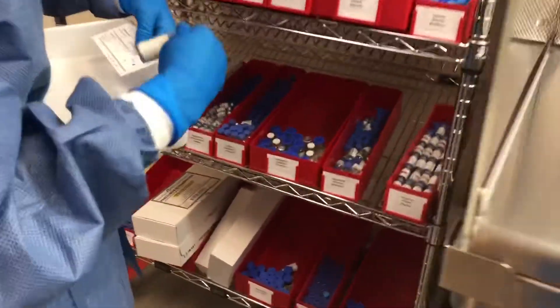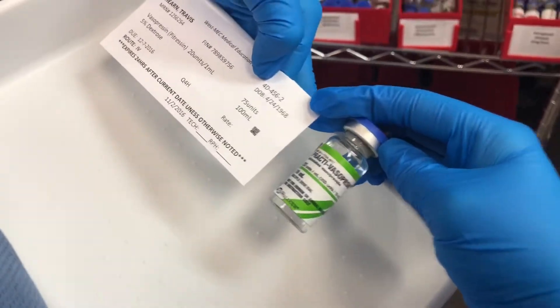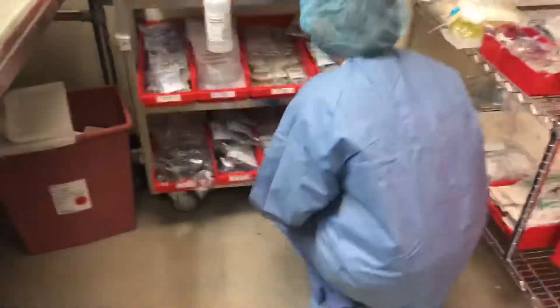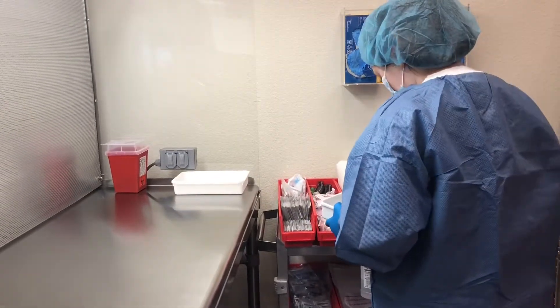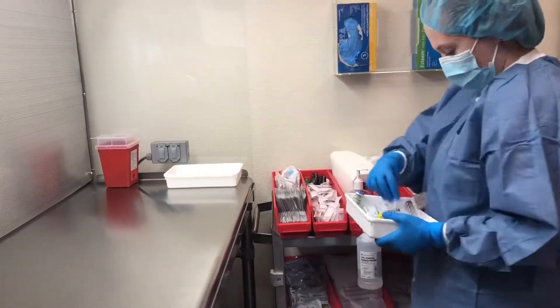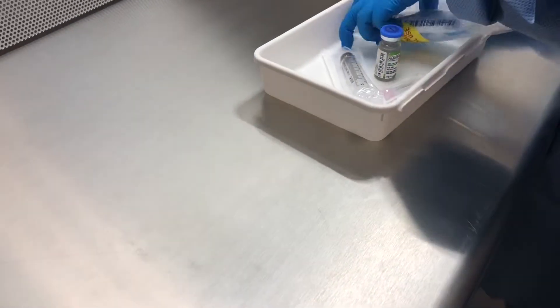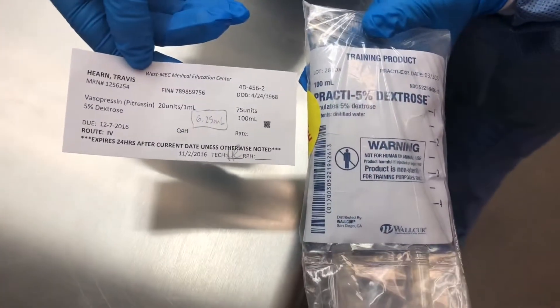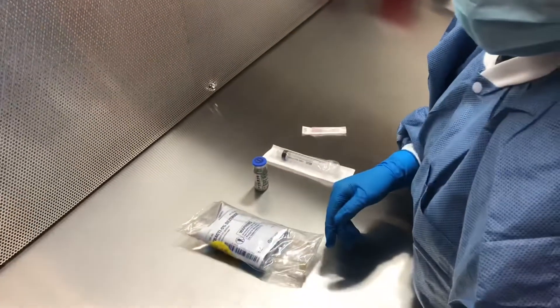Next, grab your medications and be sure to double-check that it's the right one with your patient label. Also, double-check your solution to make sure it's the right concentration as well as the right amount of milliliters. Next, grab a syringe and a needle that is appropriate to the compound that you are making. Before you start compounding, make sure to double-check that both your medication and your solution are correct, and that you know how many milliliters you will be drawing up and putting into the bag. As you take your products out of the basket, make sure that they are 6 inches from you as well as 6 inches from the filter, and lay them out in an order that is easy for you to use as you are compounding.